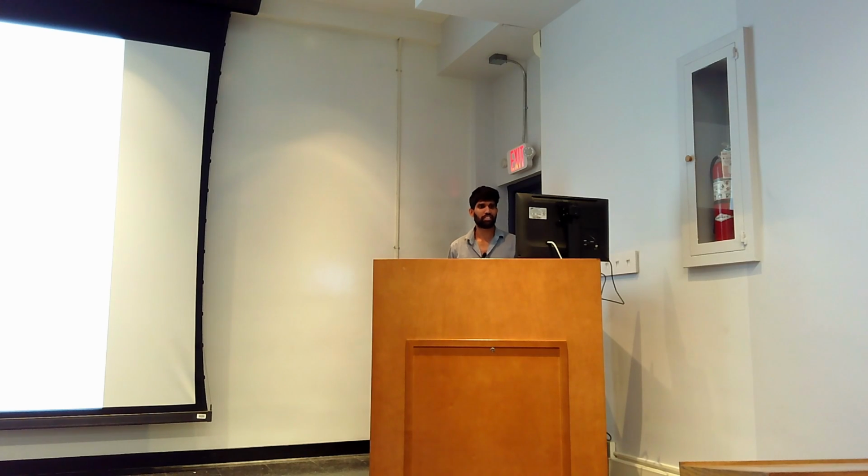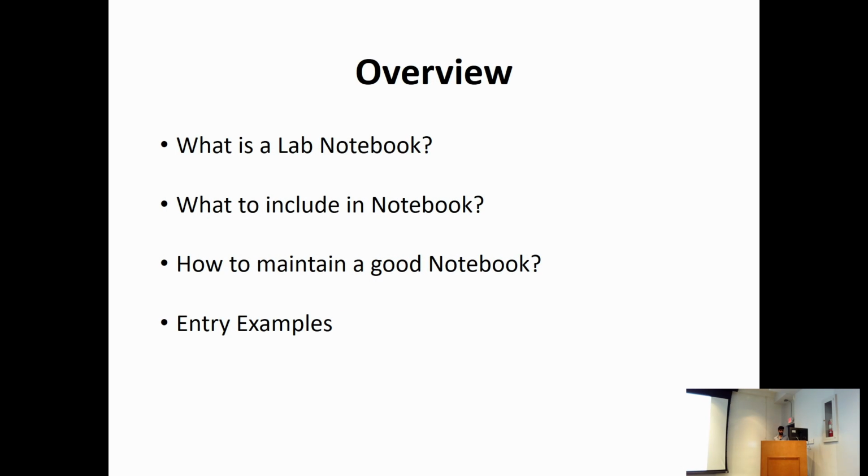In session number 10, I will be talking about the basic rules you have to follow to maintain a good lab notebook. I think most of you have already started working in labs, so for some of you it will be a review. But if you are new to the research environment, there's a lot to take away from this session. These are the major focuses of my talk today: what a lab notebook is, what to include in it, and different ways you can maintain it well. Throughout the presentation, I will show you some examples too.